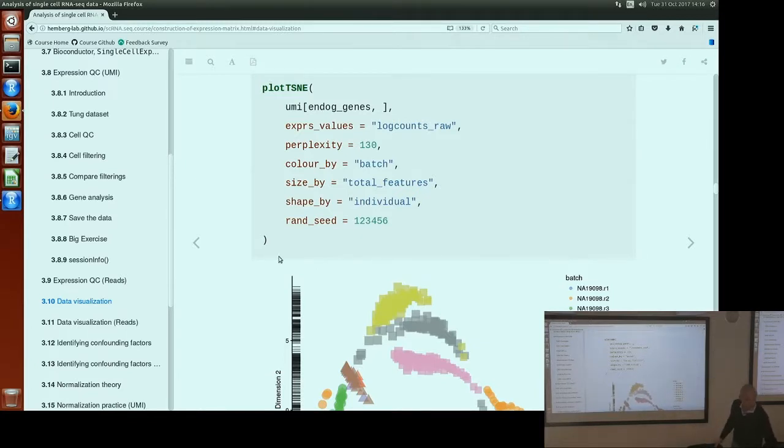Is the R in the rank node? Is it like the chance of going back to the same node that you started from? It's something sort of like the number of expected neighbors for each given cell.